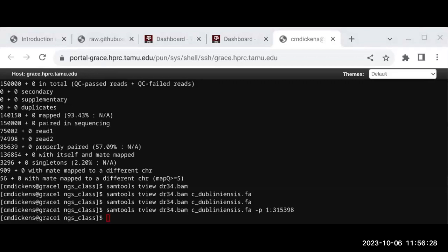All right. We've got about 30 minutes. I want to go through the next few slides. We have one more exercise at the end. Variant calling, finding SNPs and indels in a sample. We have a lot of tools there.